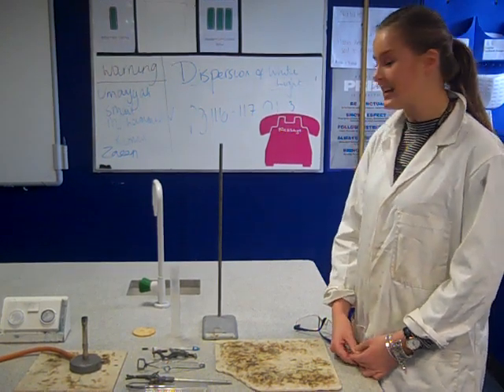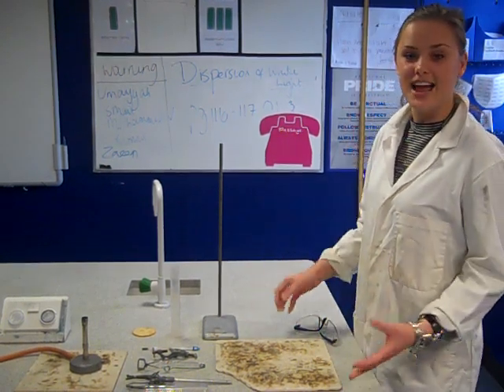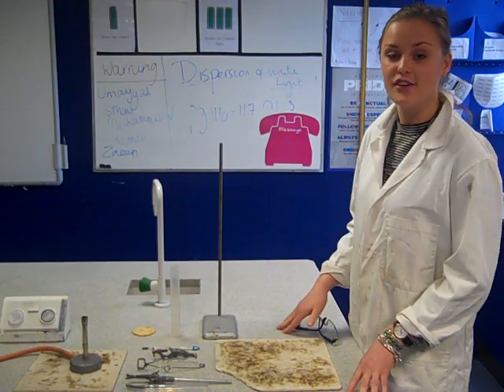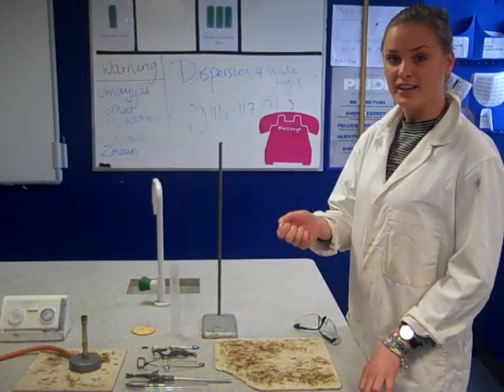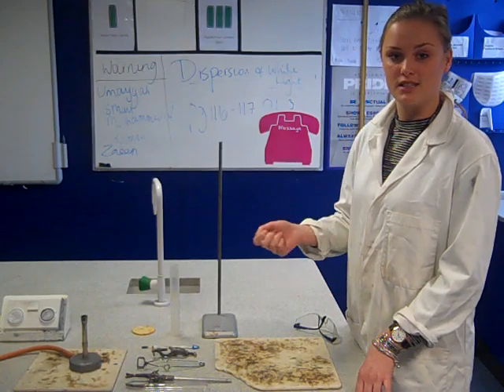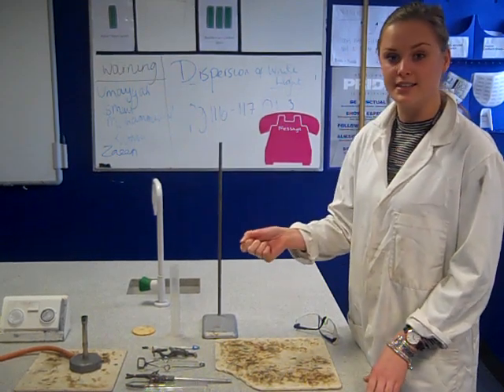Okay, so today we're going to be doing an experiment to find out how much energy is in different kinds of food. We're going to be doing that by burning the food and seeing the temperature rise of water when we hold that burning food underneath it.